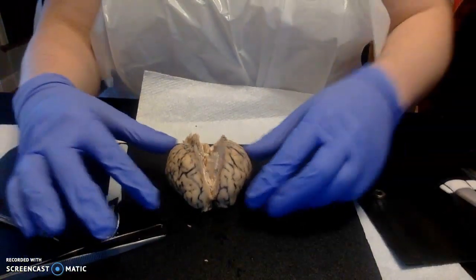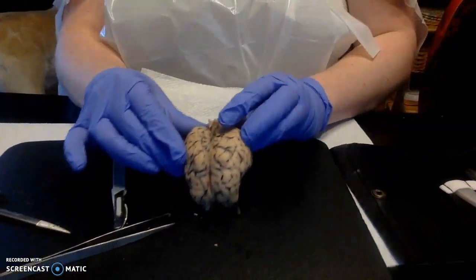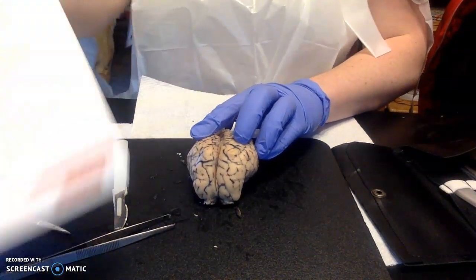My name's Hannah Kelly. Today is February 21st, 2020, and this is the sheep brain dissection. So first, I'm going to show you, and here's my notes.